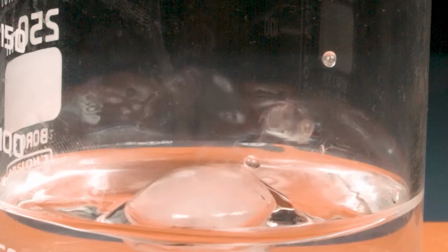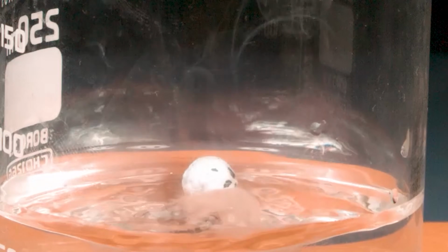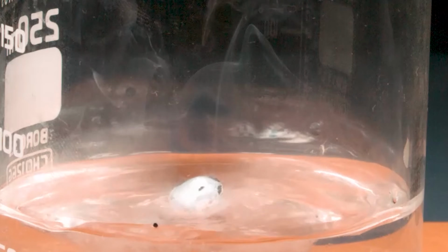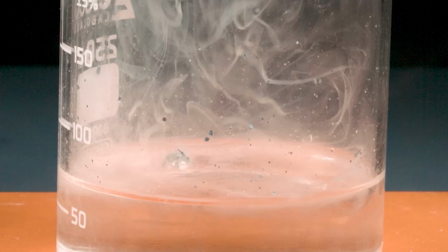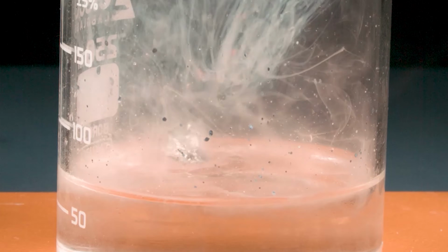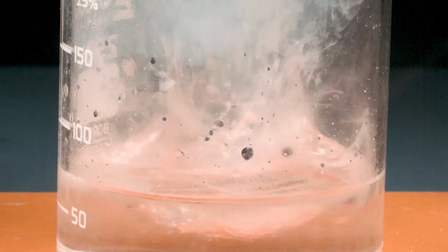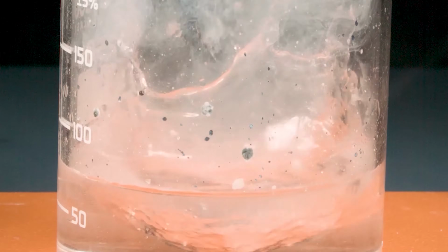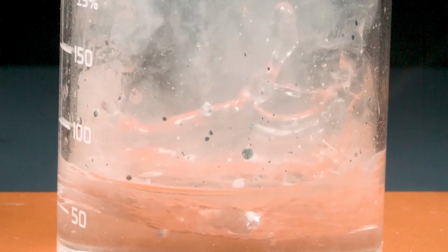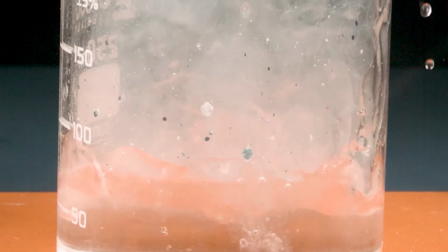Now here is a close-up of that bubble forming, the mushroom cloud, and then boom, ignition. Again, pale and difficult to see with the naked eye and with the camera. Fast forward maybe half a second into the future, finally the explosion happens and you can see the shrapnel flying with the molten bits of potassium, again glowing with that pale, it's not really orange, it's more of a purple or violet color. It's quite a beautiful color actually.